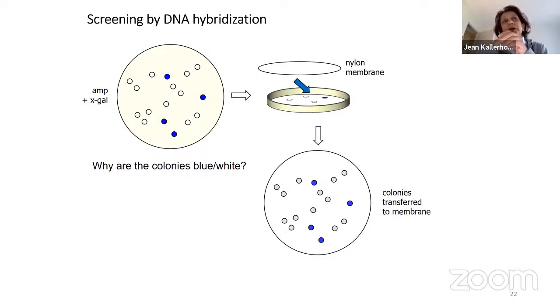But now, for security reasons, we tend not to use radioactive labels, because we don't want students to work with radioactive substances, and for the environment, we need to get rid of them. It's too complex. So we work with non-radioactive labels, but both are as sensitive. It just depends on the optimization procedure.